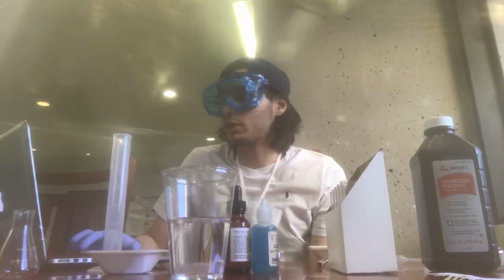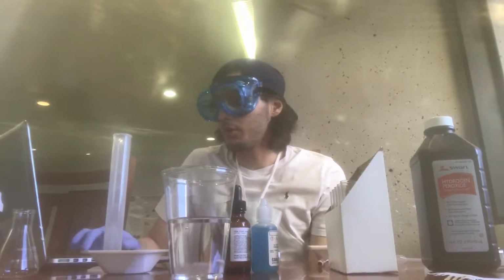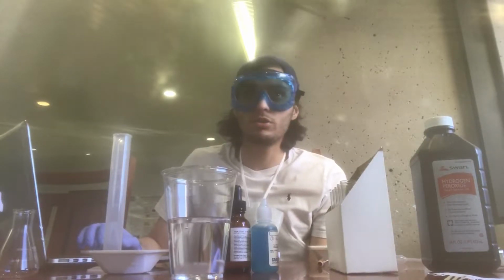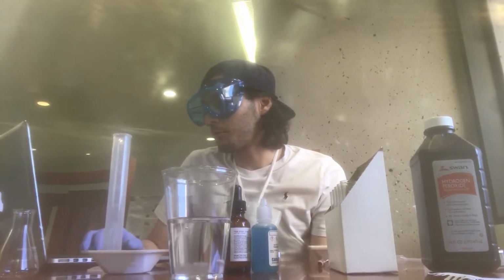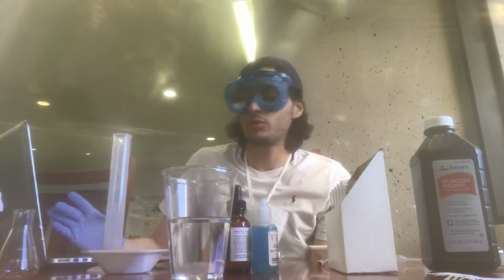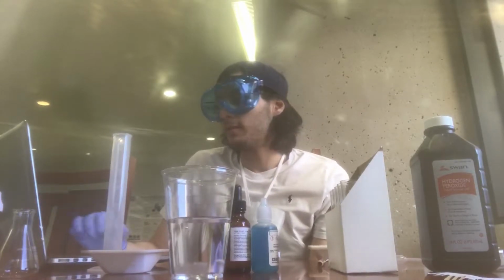Today I will be doing lab experiment number 4, equilibrium and Le Chatelier's principle. Before we do the experiment, it's always good to understand what you're doing and why you're doing it. So we're going to do a quick overview and the background of the whole experiment.